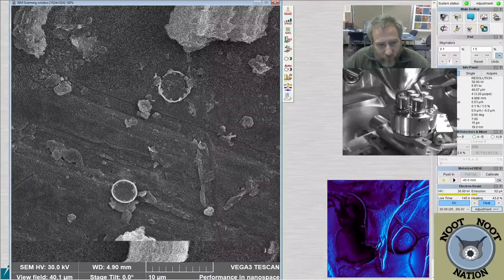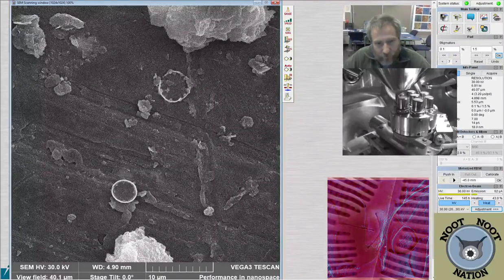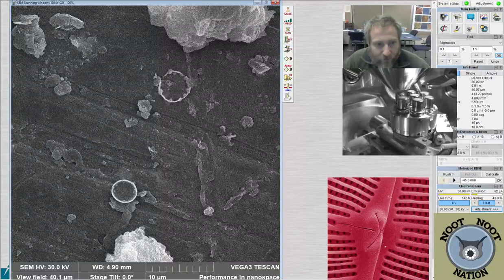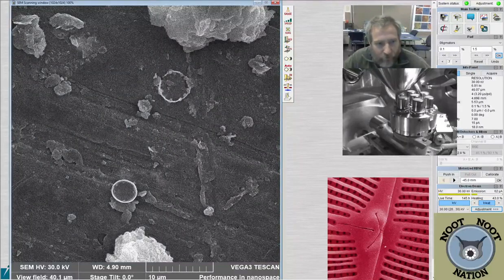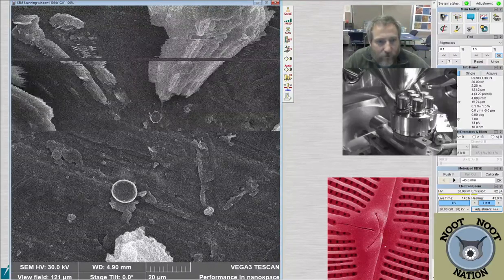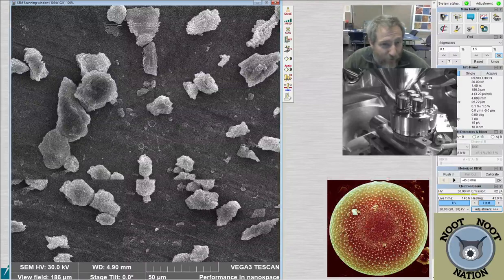They're all small. These are 5 microns or less. This one's also in the sort of 5 to 7 range right now. But you can see there's some sort of different structures to the two different diatoms. So they don't look exactly the same. If they did, they'd be the same species.